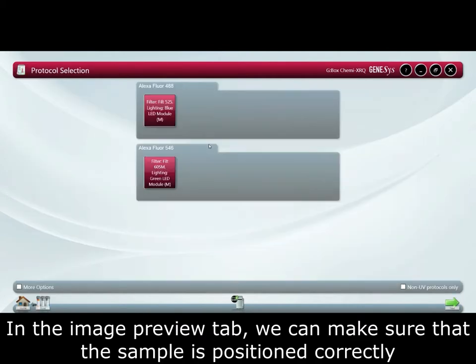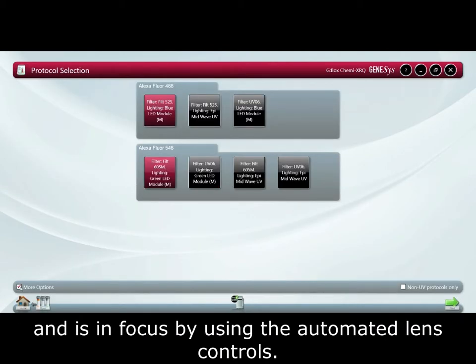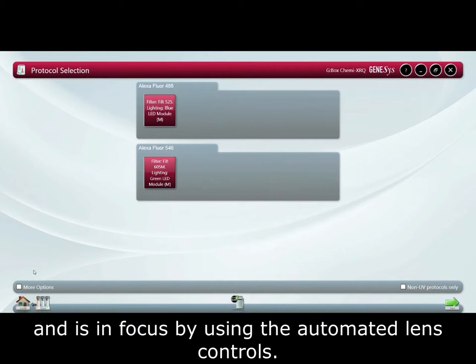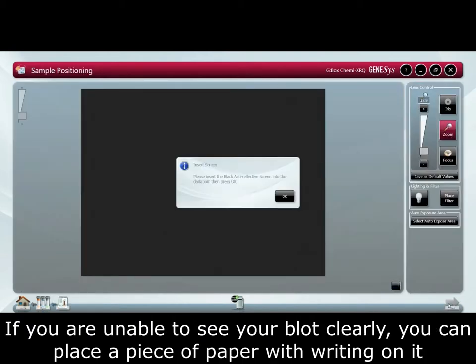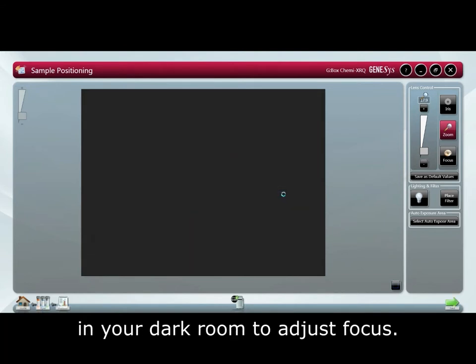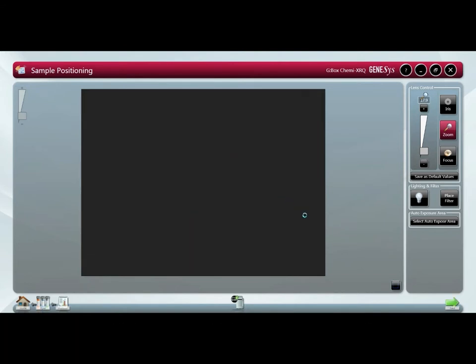In the image preview tab, we can make sure the sample is positioned correctly and is in focus by using the automated lens controls. If you are unable to see your blot clearly, you can place a piece of paper with writing on it in the darkroom to adjust focus.